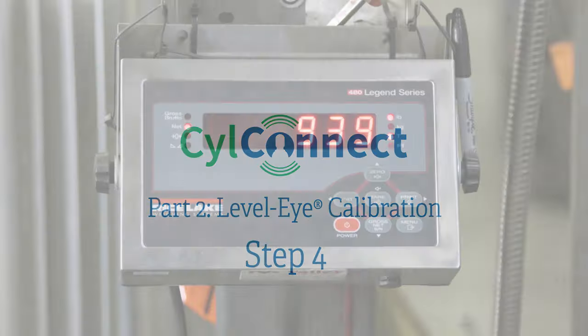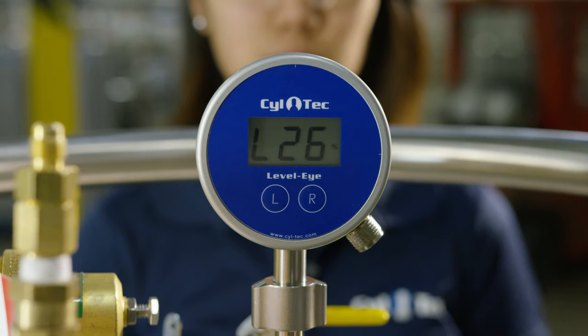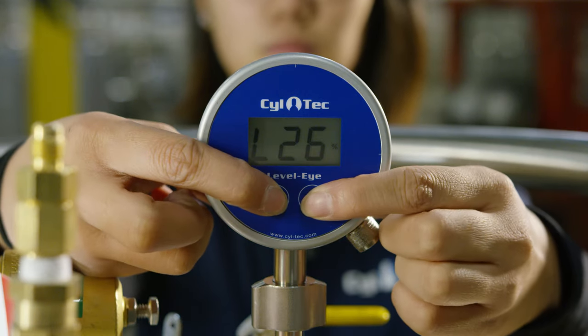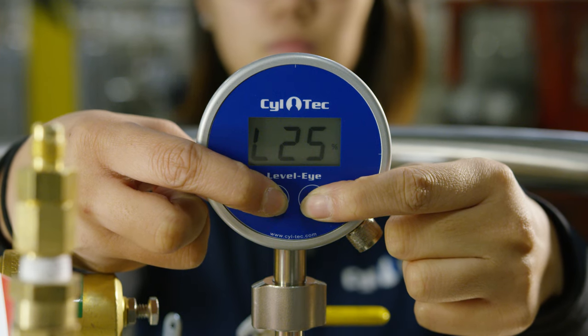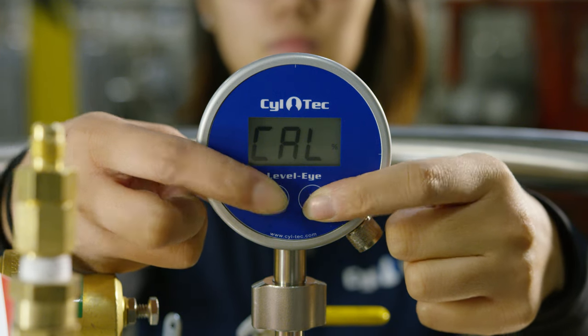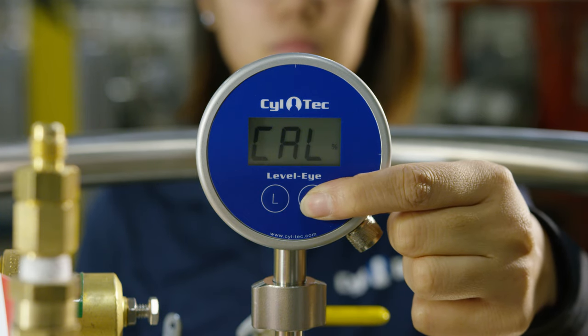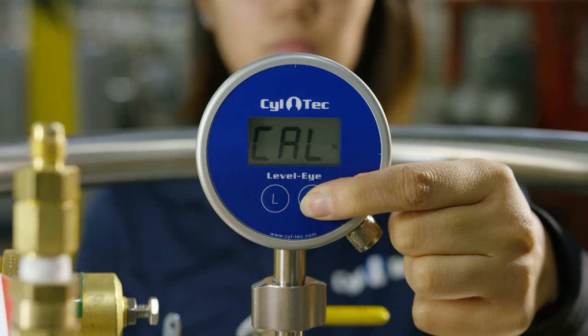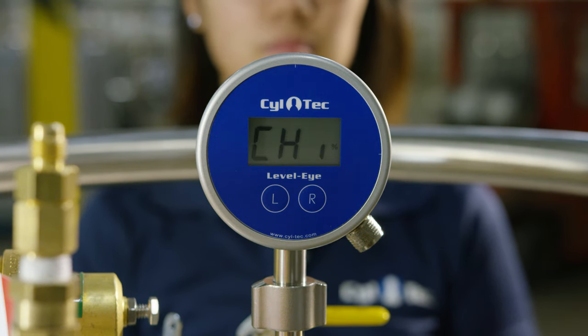Step four: complete the filling process before performing a high calibration. Wait five to ten minutes to allow the liquid to settle. Enter calibration mode again by pressing the L and R buttons until CAL is shown. Hold down the R button until High is displayed. Release the button and wait for the word C-High to display, confirming that the high calibration is complete.